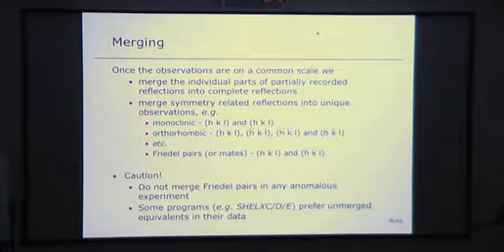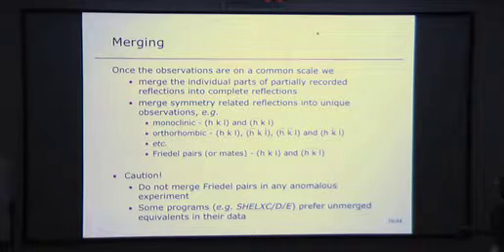Also, some programs, for example the SHELX C/D/E pipeline, prefer you not to merge your symmetry equivalents together, because George Sheldrick wants to do it his way for his programs, basically. I'm sure Andrea could comment on that.